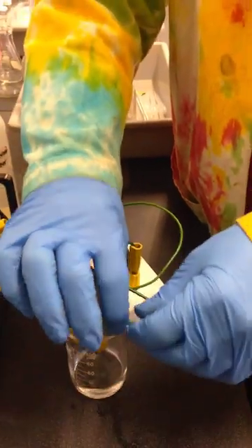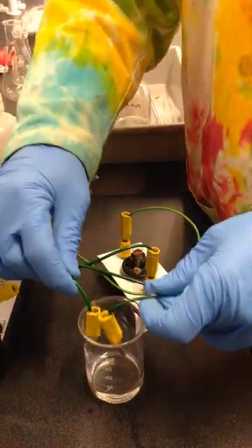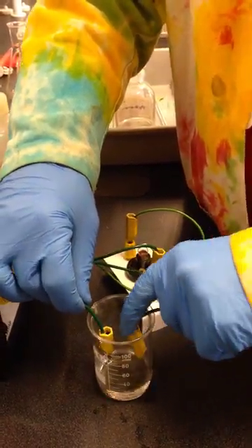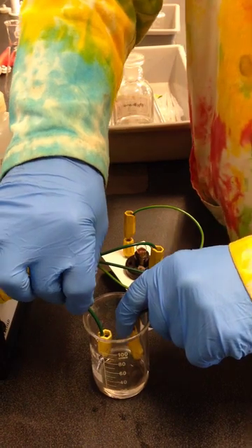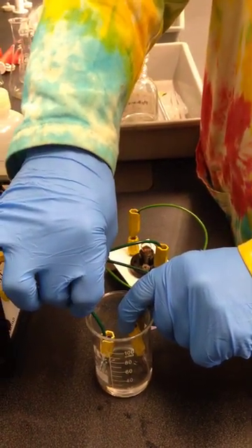When I put the leads, I just double check that the light bulb's still going. It is. I put these two leads right in the water. Make sure they're in the water. And you can see that the light bulb does not glow.